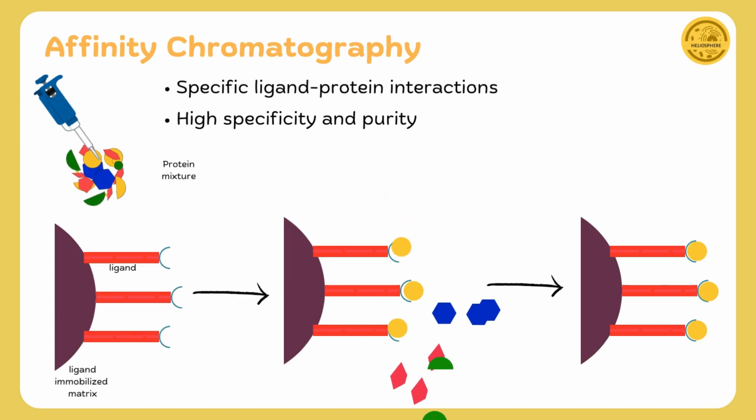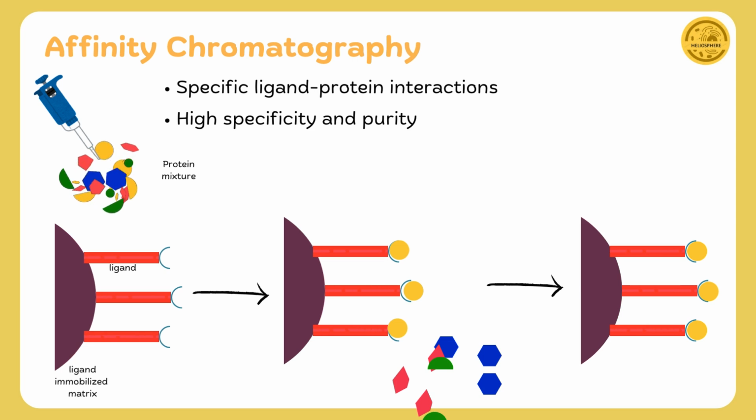Affinity chromatography. This method uses specific interactions between a protein and a ligand attached to a stationary phase. It's highly specific and effective for purifying proteins from complex mixtures.